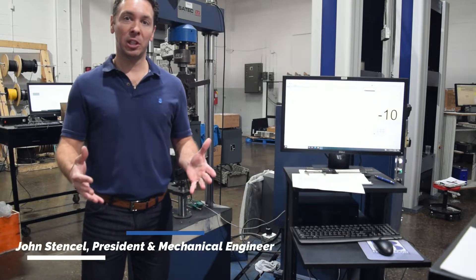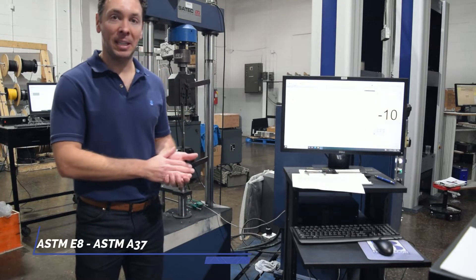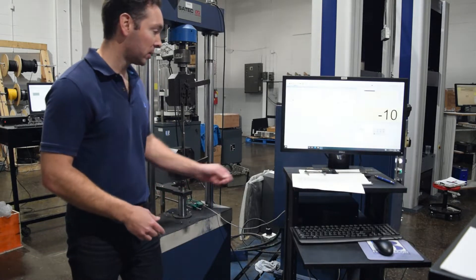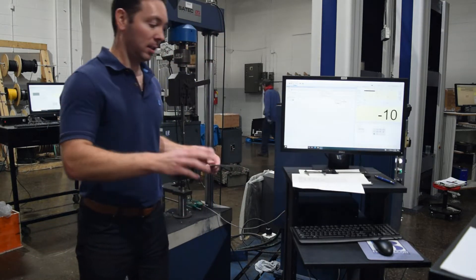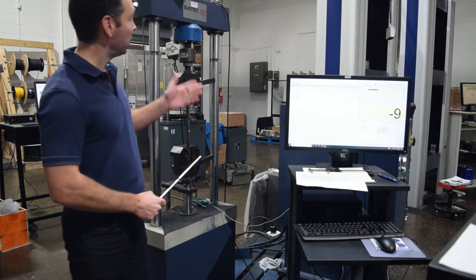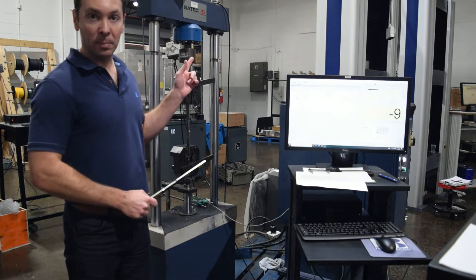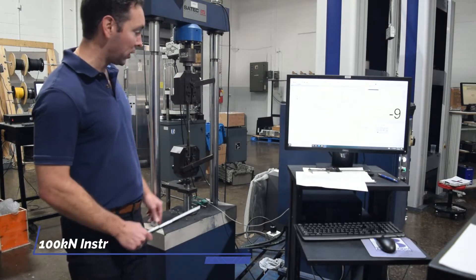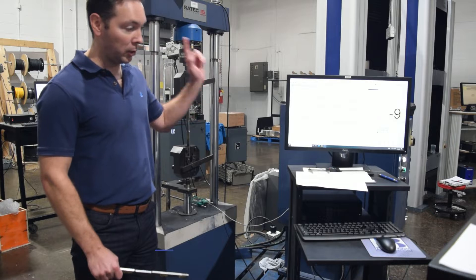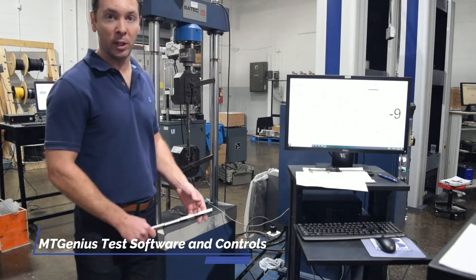Hi, John Stenzel, Frank Bacon Machinery. Here we are going to do some ASTM E8, ASTM A370 Stenzel pulls of a standard flat dog bone. Here we are running it on a 100 kilonewton Satec Instron model TVL, which is a servo hydraulic machine that was rebuilt by us at Frank Bacon Machinery with our new MTGenius software and controls.